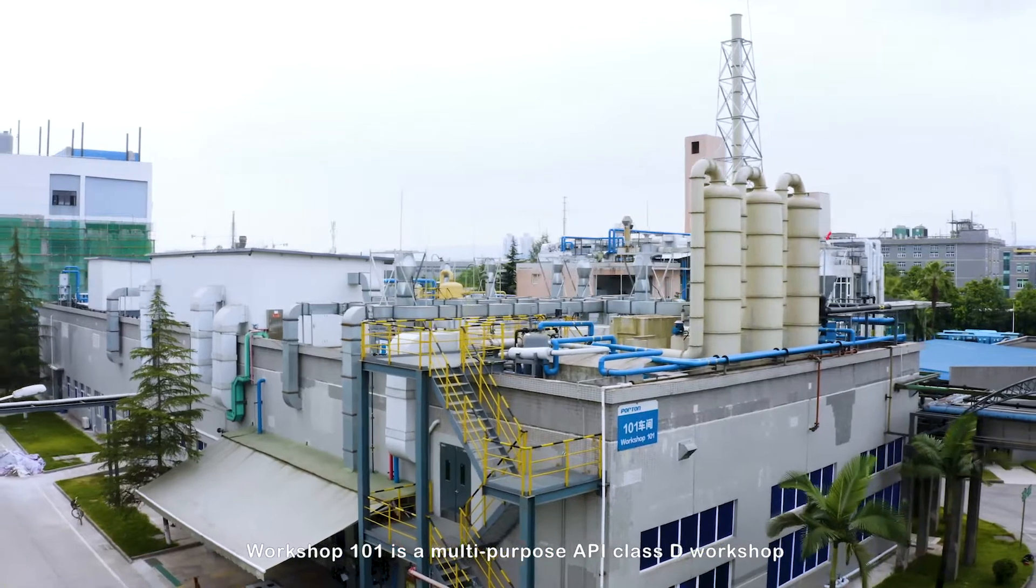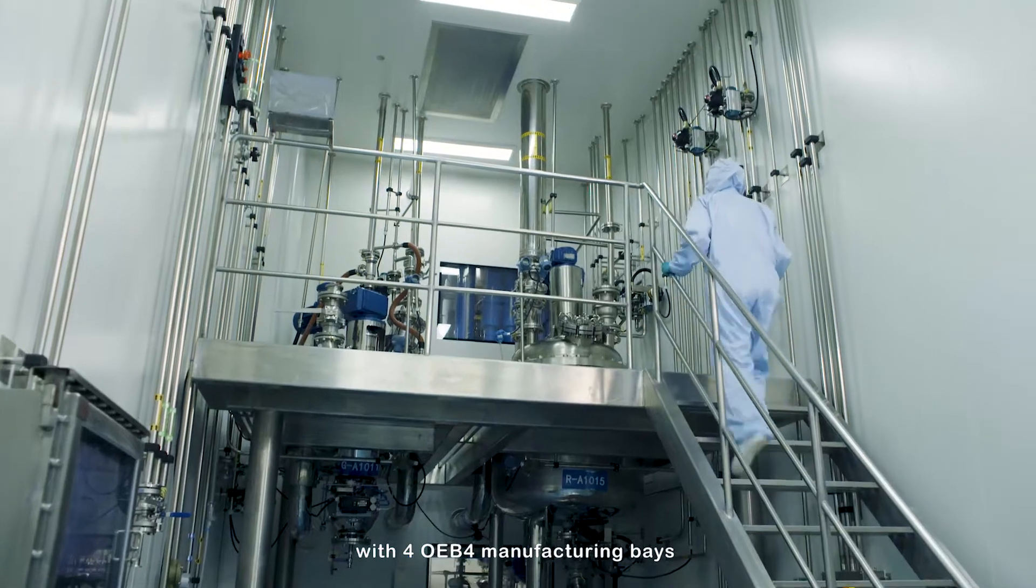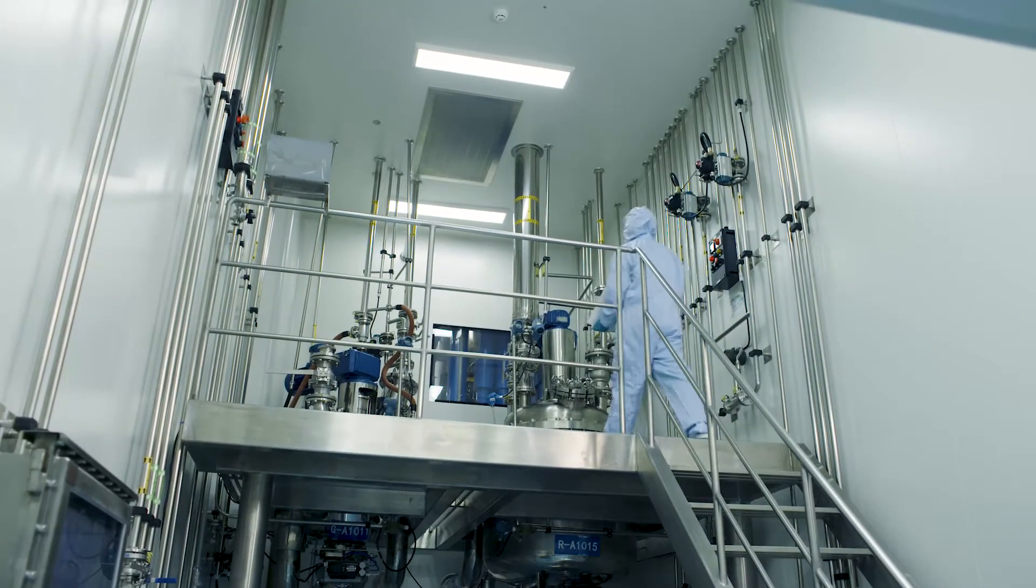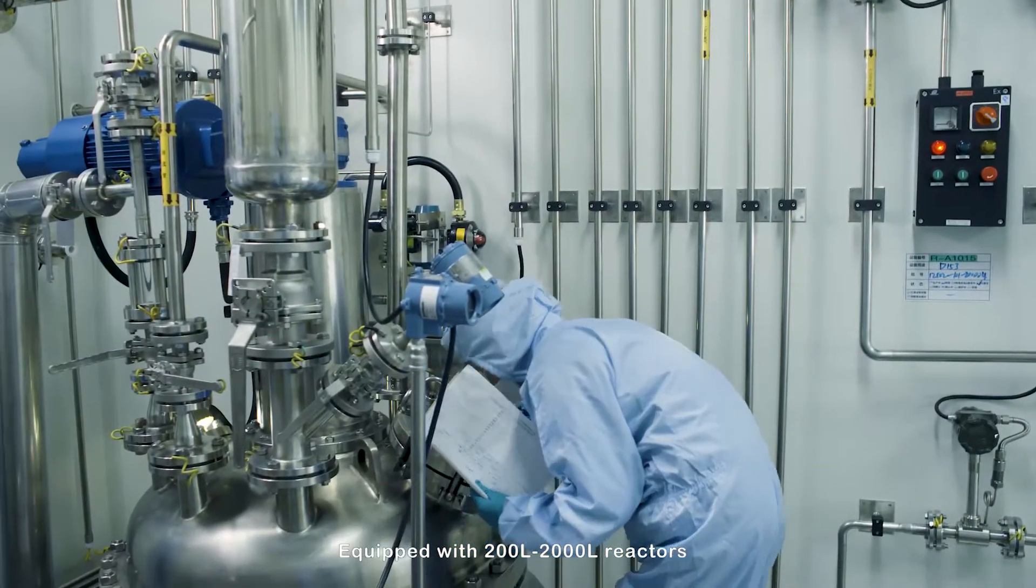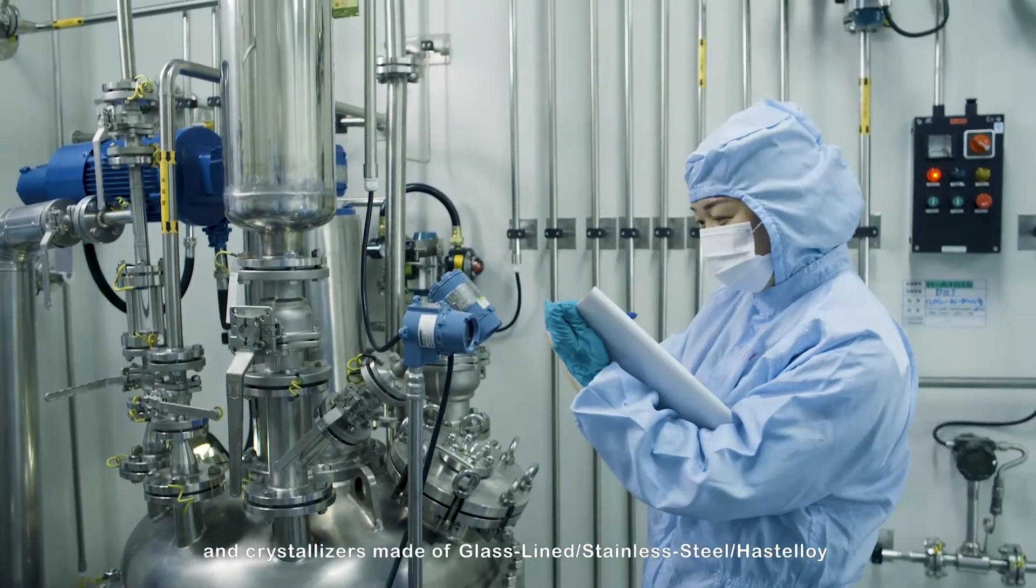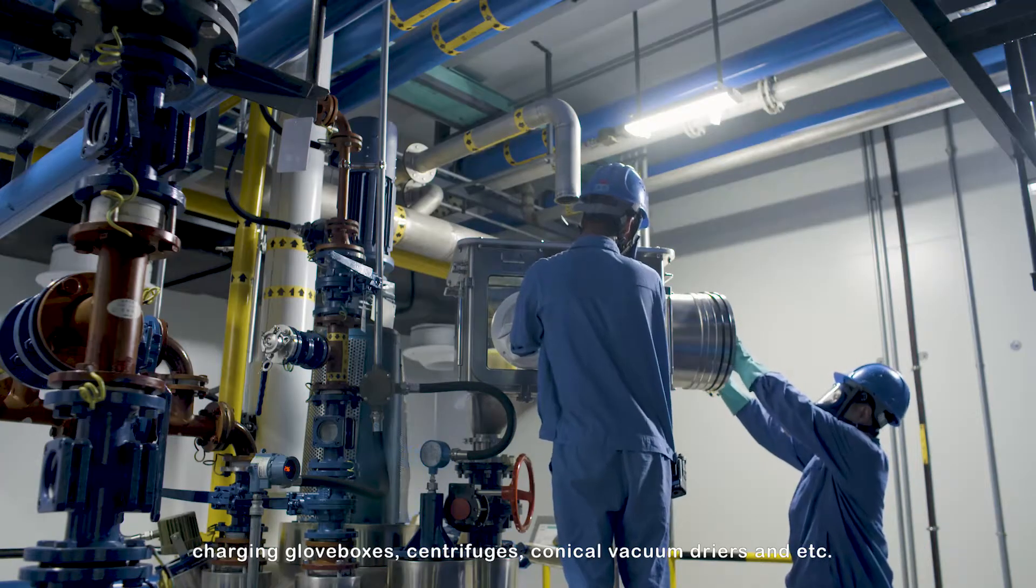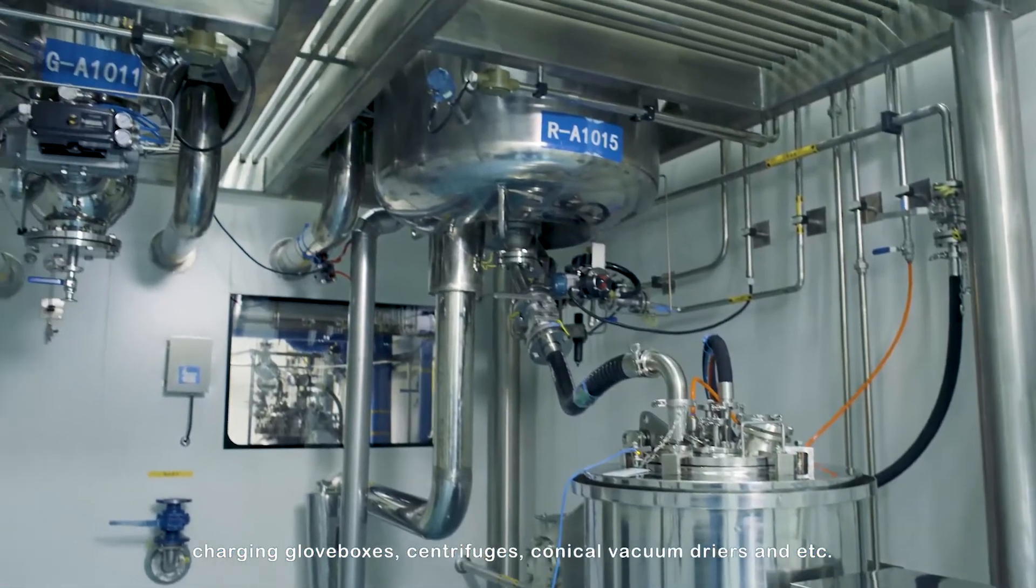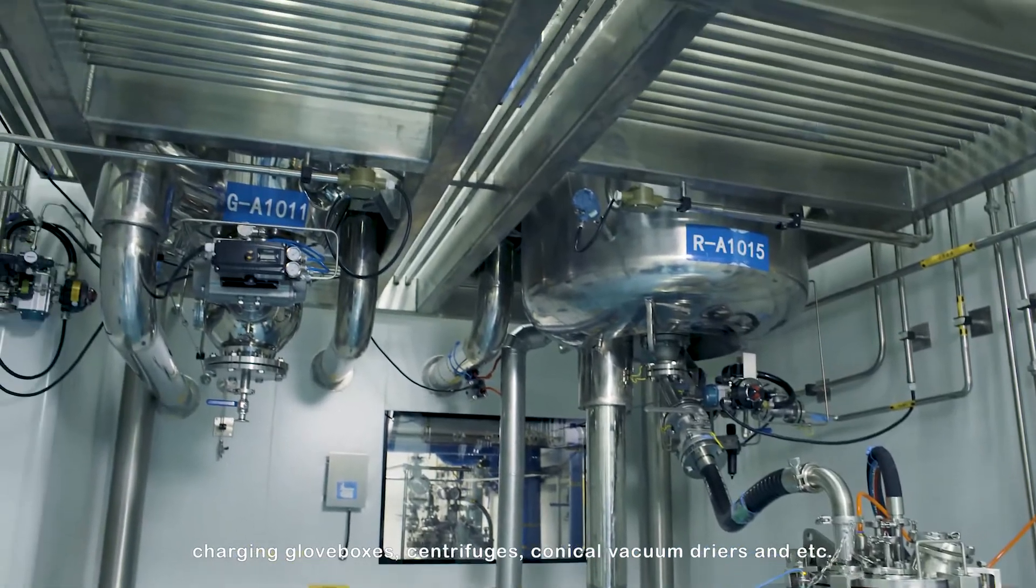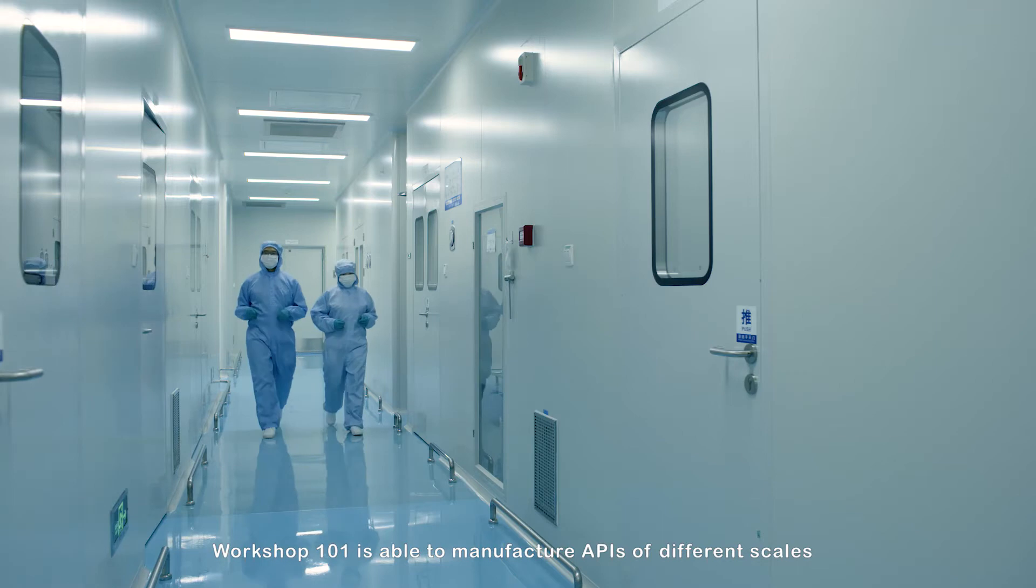Workshop 101 is a multi-purpose API Class D workshop with 4 OEB4 manufacturing bays. Equipped with 20 2,000-liter reactors and crystallizers made of glass-lined, stainless steel, hastelloy, charging glove boxes, centrifuges, conical vacuum dryers, and etc. Workshop 101 is able to manufacture APIs of different scales.